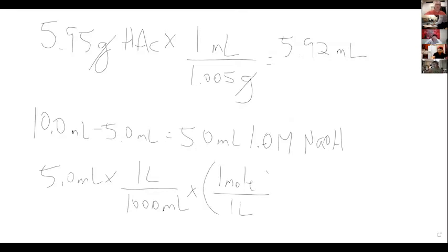That's my concentration, 1 molar. mL, liters, left with moles. So it's 5 divided by 1,000, or 0.0050 moles.